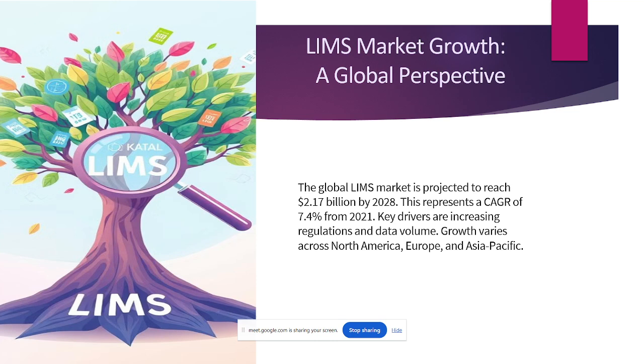Some companies and industries are still doing paper-based work right now. Some startup companies and startup pharmas, as per the FDA regulations, have to convert from paper to paperless. That is called LIMS. So they have to install the LIMS application, create that environment, and then perform the lab operations in the LIMS only.